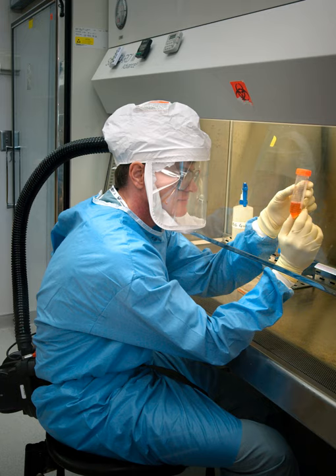However, these assertions have been formally disputed in at least one peer-reviewed article, which points out that there is no cited basis for the need to remove dust and dirt from bulbs. Properly functioning biosafety cabinets have very clean air, so dust is less likely to build up. Laboratories are generally air-conditioned, which eliminates the concern over humidity inhibition of UV effectiveness. With proper use, UV exposure risk to users is very low.